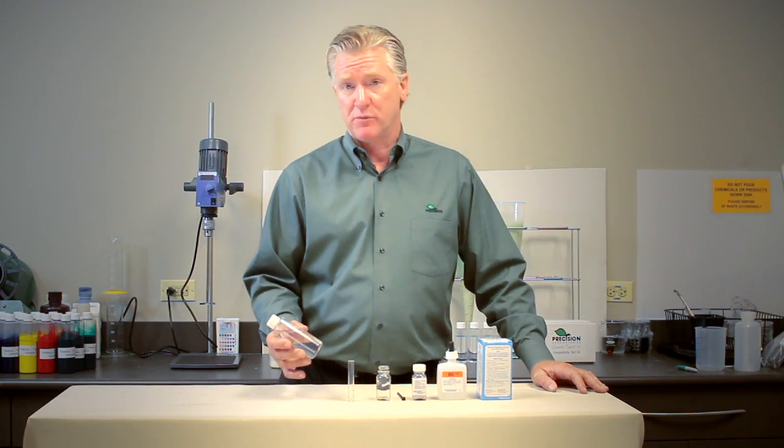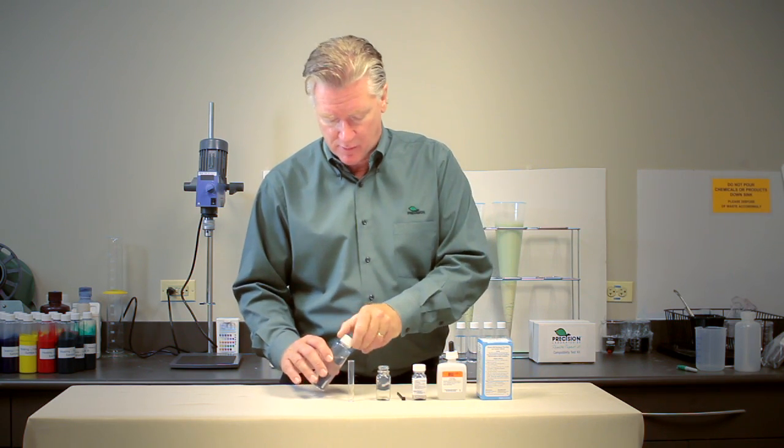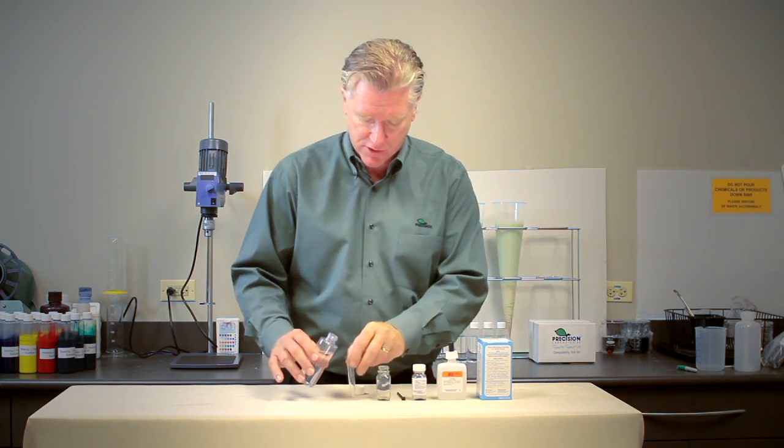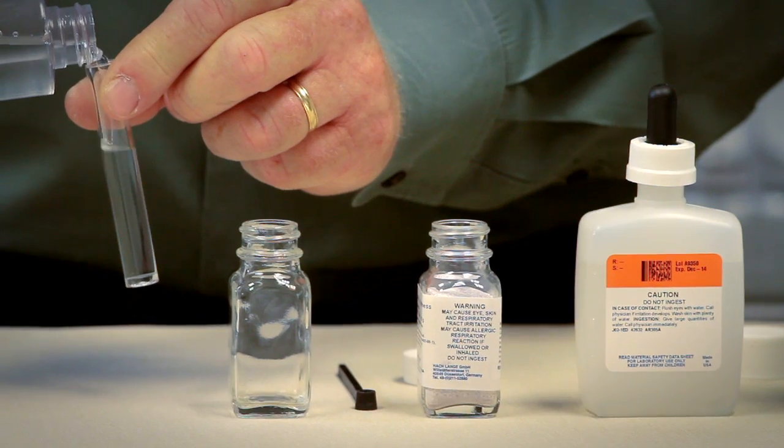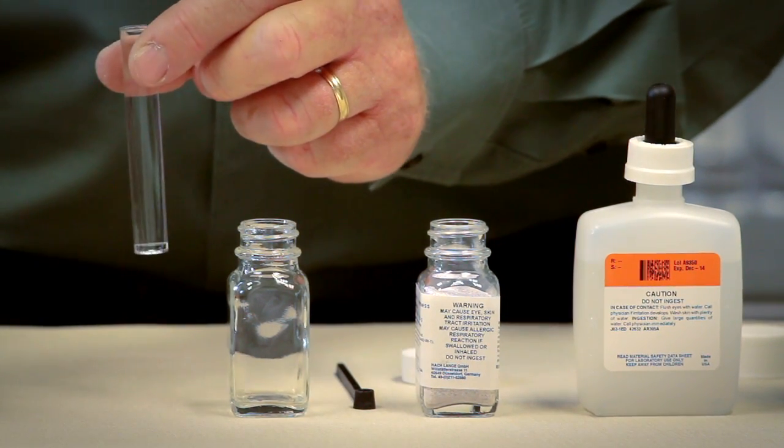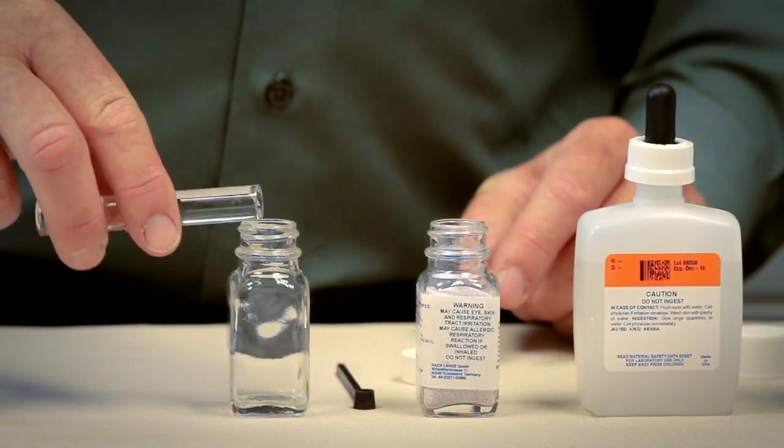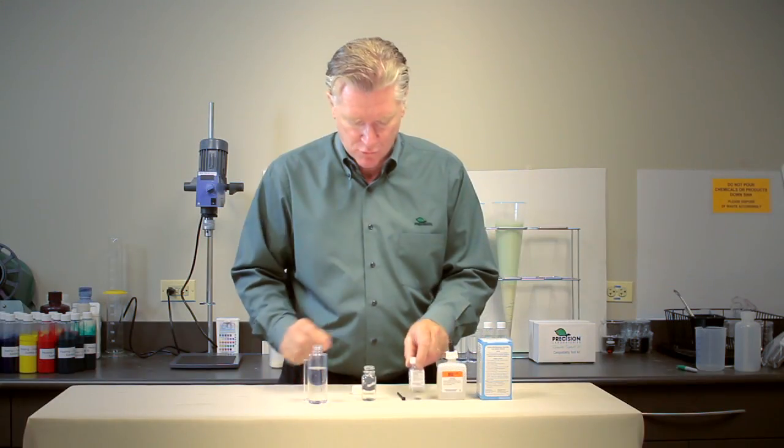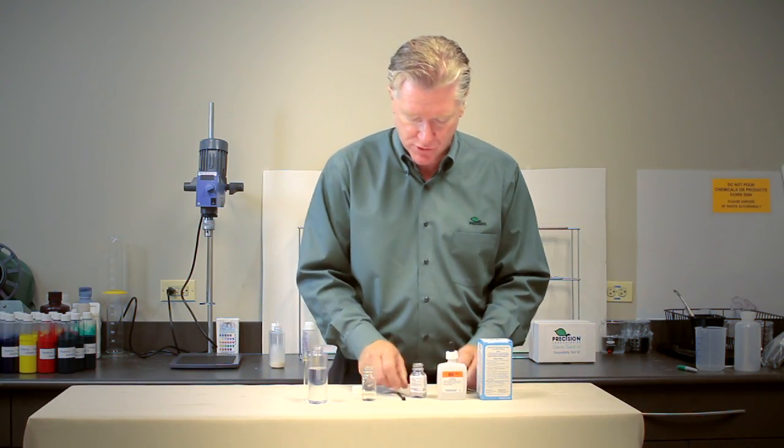So what I've done is I've grabbed a sample of water from the farm and I'm just going to transfer it into the measuring container like this. Now that I've got it measured out I'll put it in the mixing chamber and I'm going to add one level scoop of reagent to it.